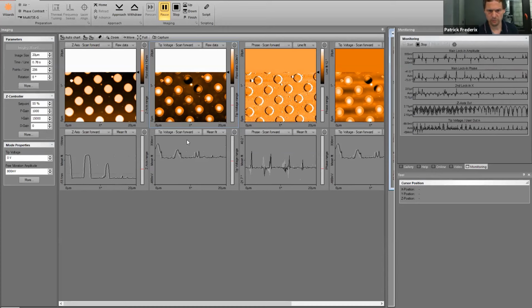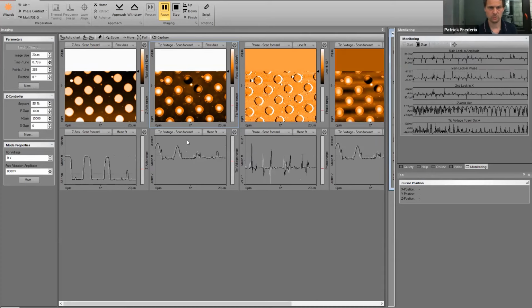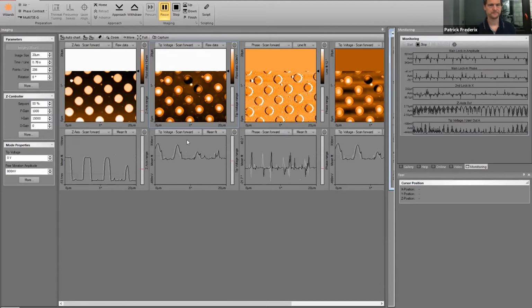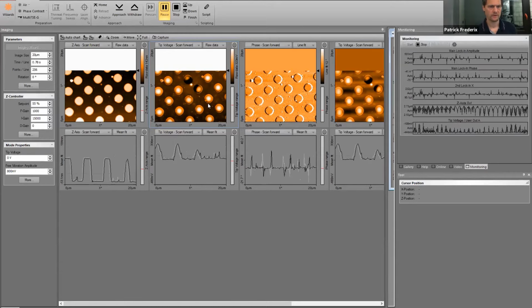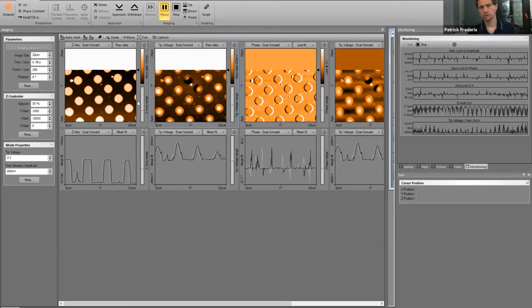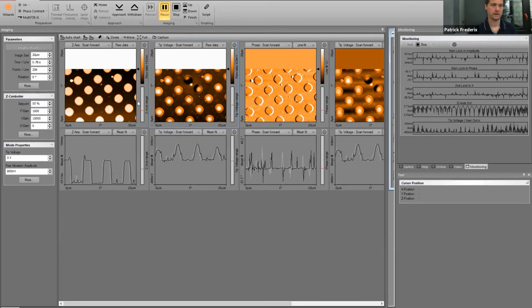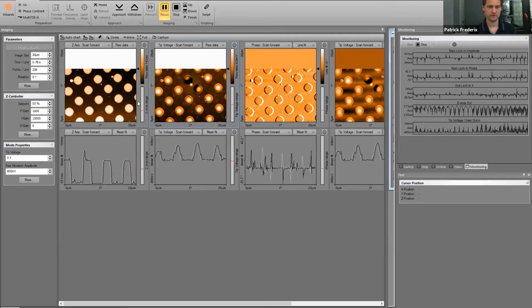They have some different properties. So apparently there is some material deposition or so on top of these surfaces. This is all run in single pass mode, so tip voltage and topography are measured at the same time.